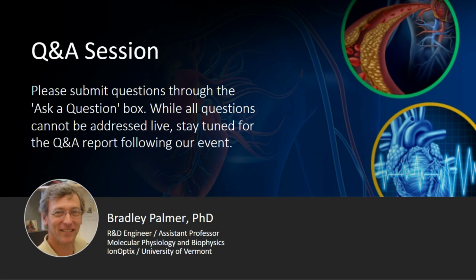All right. I think that was a pretty good response. I think I'm going to make this next one the last question. I'm actually going to squeeze two in there and see how that goes. They're both about how long one has to wait for the relaxing solution before you can start measurements, and how long the slices are viable during an experiment, specifically with electrical stimulation.